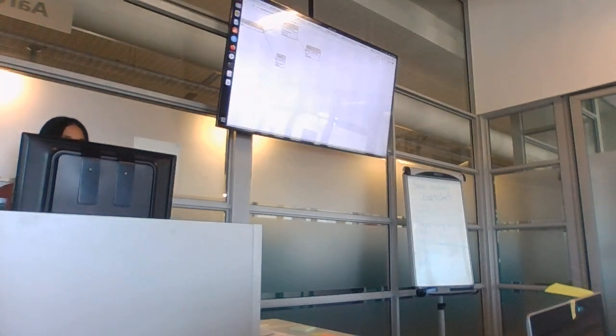I'm not sure why we're trying to. If you have a different tool that's running, does it affect having this image? Or can you only save this image if that workflow is not running? Oh, you mean this isn't? But did you extract your workflow? No, you can only see it if you extracted it. So it can be running.